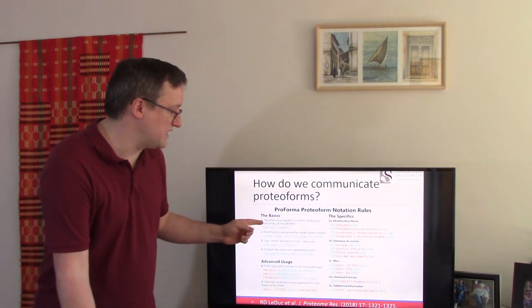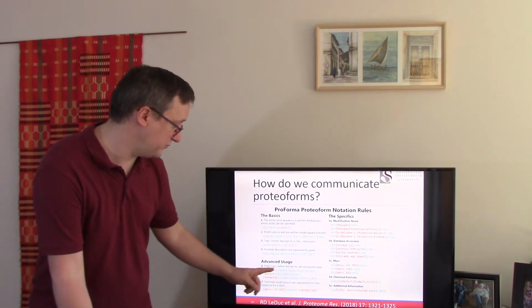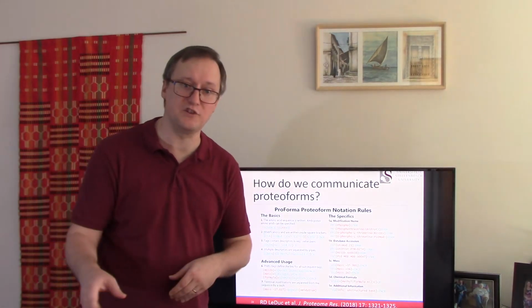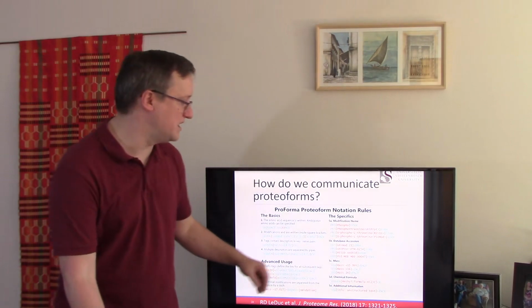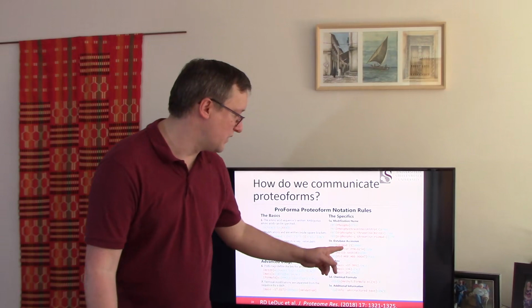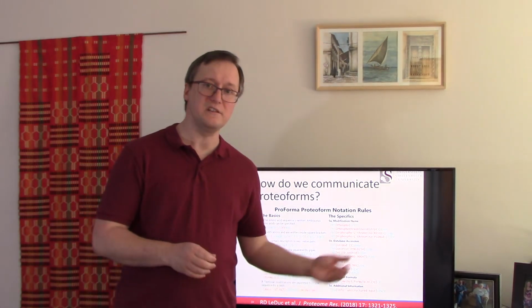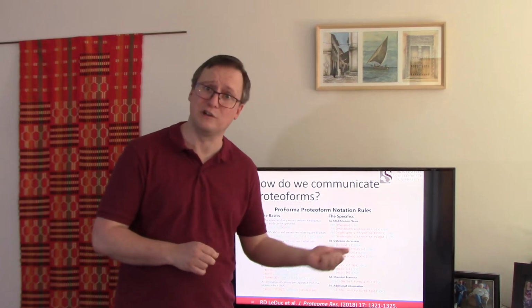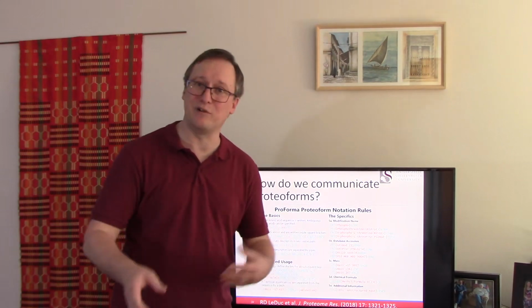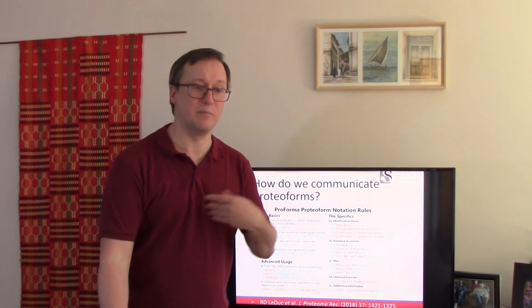So how can we express amino acid sequences and the ambiguity associated with some of those? How can we handle an amount of mass missing at the N-terminal side or the C-terminal side of a sequence? How do we name the modifications within the sequence? What are the acceptable ways to describe an accession number? Now this is not a HUPO-PSI standard, but Richard Leduc has been coming to the HUPO-PSI meetings. I hope that someday this will become part of how our group communicates proteoforms.